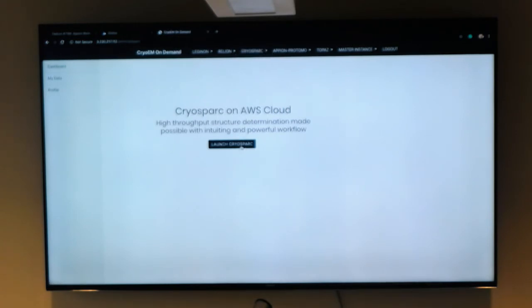But we're going to do something in the sense that what users will eventually be able to do is go on demand and say, I want an Amazon instance, I want computation, and then spin it up. Since it's on demand, it charges you per unit of time, and you can stop it and start it and still keep your data archived there. This is what we've been rolling out for workshops, but now you get to see a little bit more of what's up and coming.